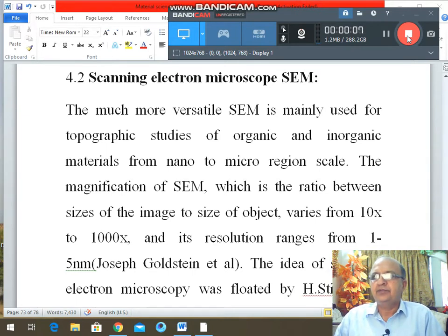Dear student, today we are going to discuss another technique for studying the surface information, grain size, grain positions, information, chemical makeup, and many things.